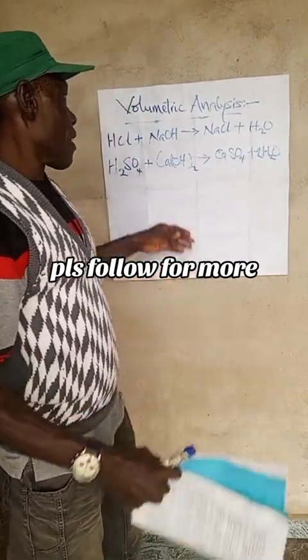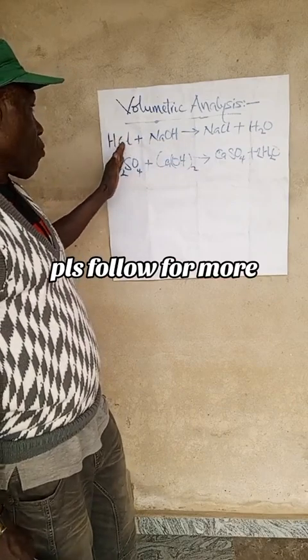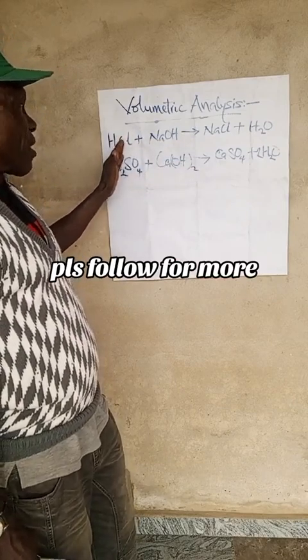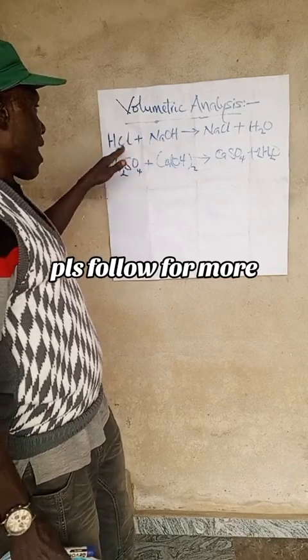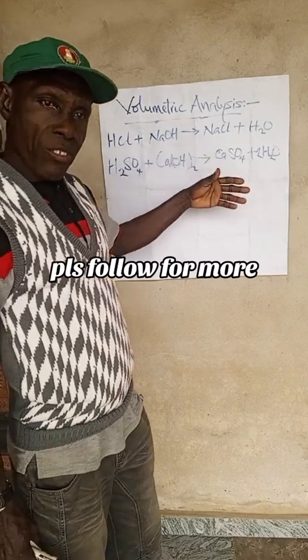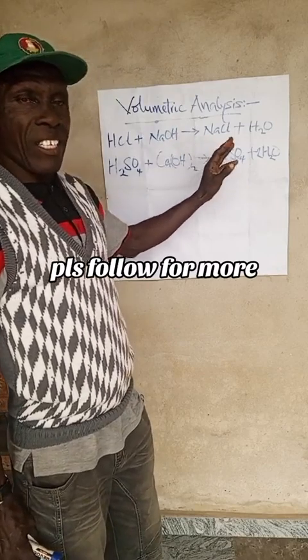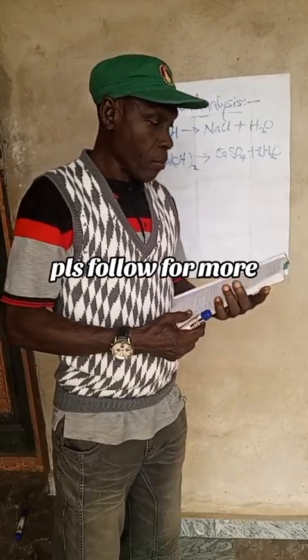Now, these are neutralization reactions. One compound will be an acid, the other one a base. So this acid-base reaction is called neutralization reaction, or we call it titration. But it's a practical thing you must do in the laboratory.